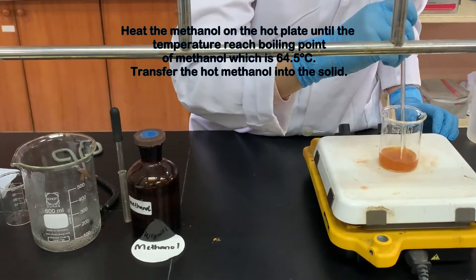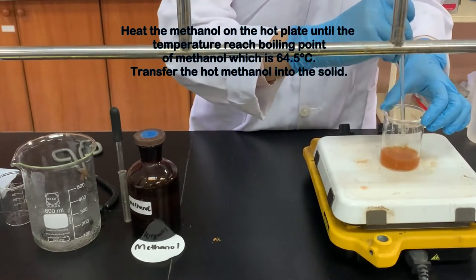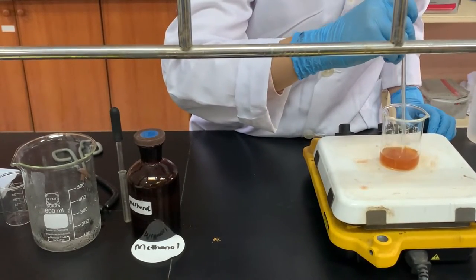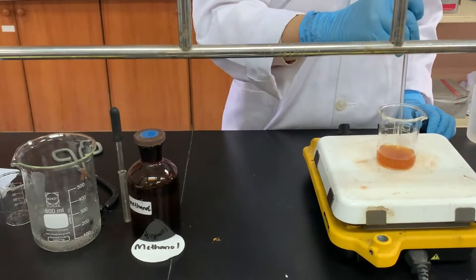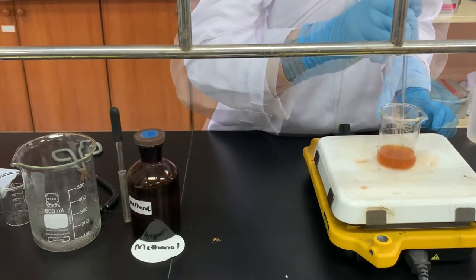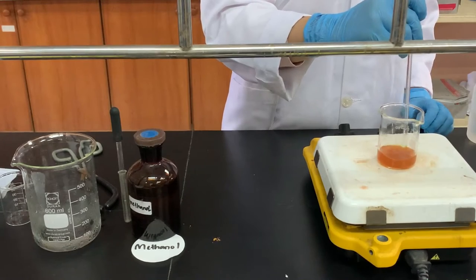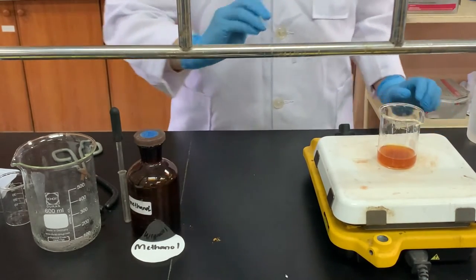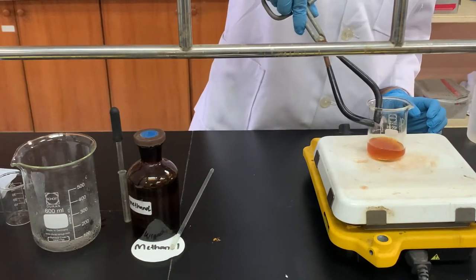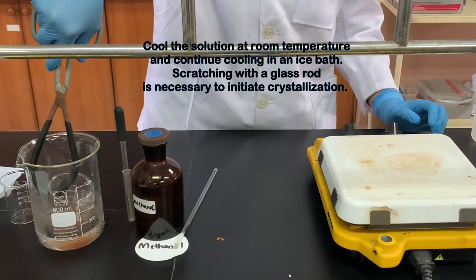Heat the methanol on the hot plate until the temperature reaches the boiling point of methanol, which is 64.5 degrees Celsius. Transfer the hot methanol into the solid. Cool the solution at room temperature and continue cooling in an ice bath. Scratching with a glass rod is necessary to initiate crystallization.